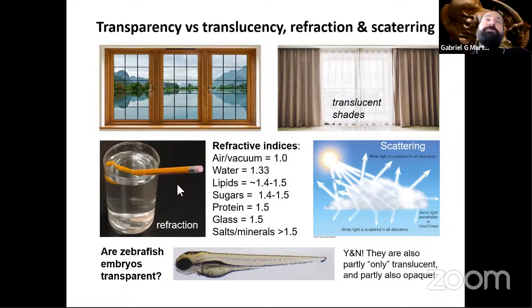And when we prepare samples and put them in the microscope, we're also going through glass. So very early on, the manufacturers, because objectives in optical microscopy are made up of glass, have basically optimized the whole system in order to have the perfect corrections. If you remember David's talk where he showed you the multiple lenses inside a microscope objective, and all the corrections that they're designed to make. Most of the times, the objectives of the microscopes are designed to look at things that basically have the refractive index of glass. This would be considered the ideal refractive index.